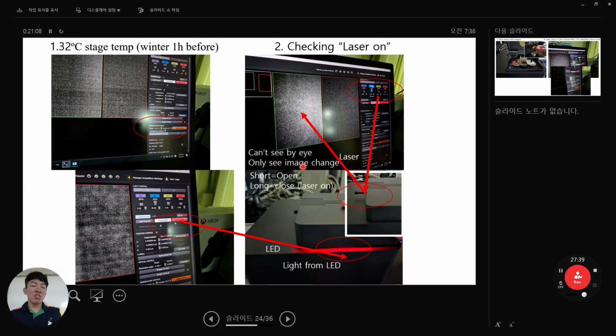And then this is like this holder, and you can see when this is going inside, you cannot see. So, and then do like this, pull out, you can open it. I'm going to show you later. So this pull out is important to imaging.